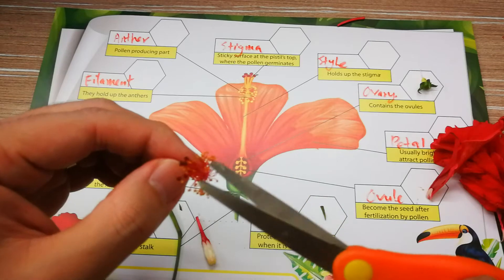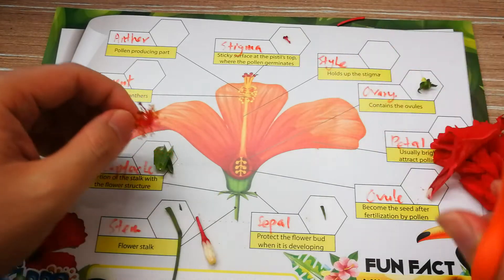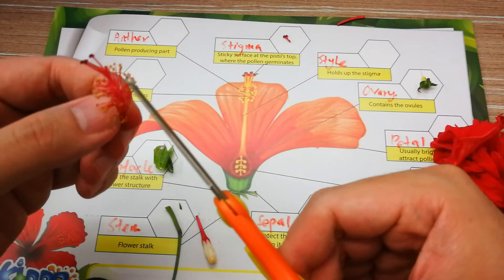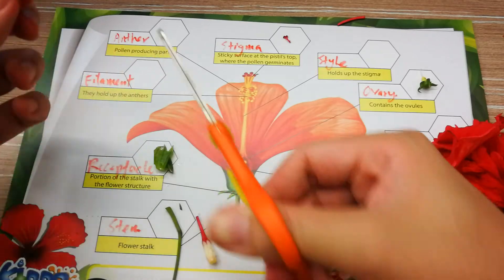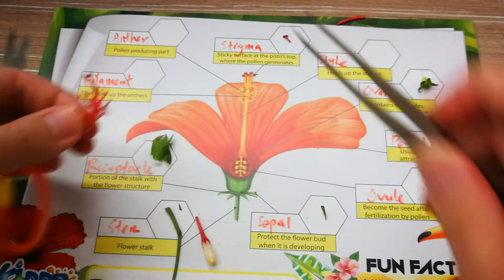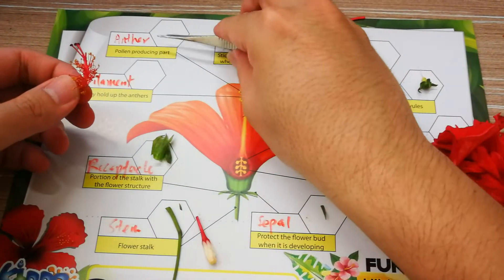The anther is very difficult to cut. This more yellow part is the anther, and actually the yellow color will be the pollen. Maybe I'll just use this forcep to take out the anther and put it over here.